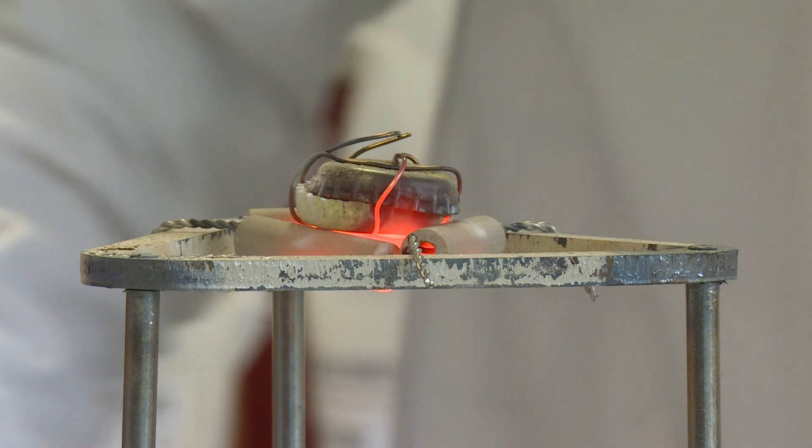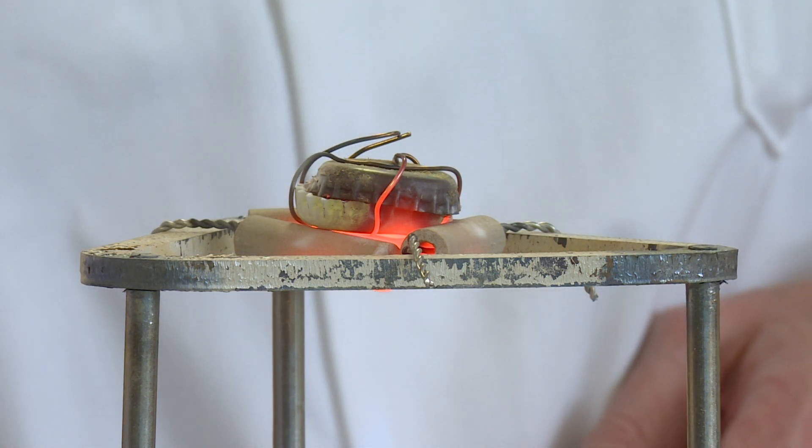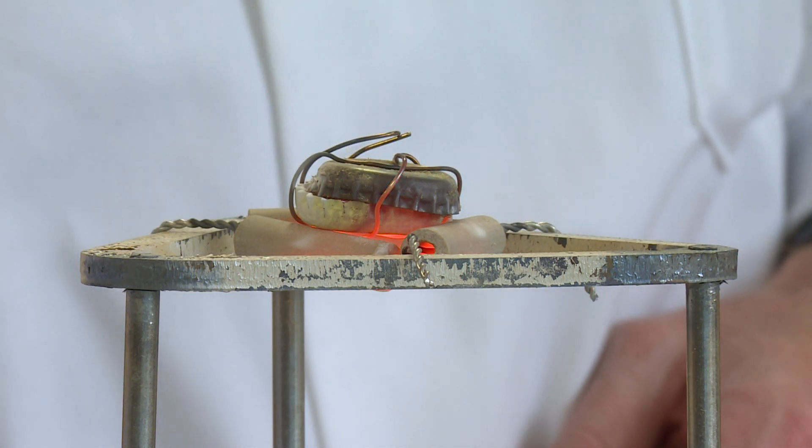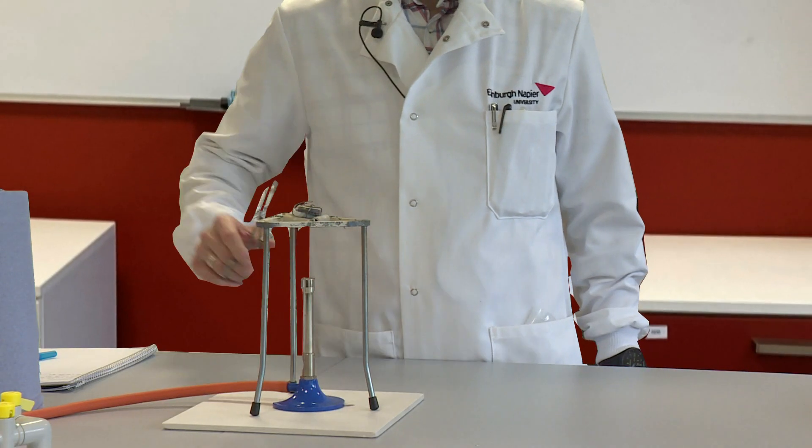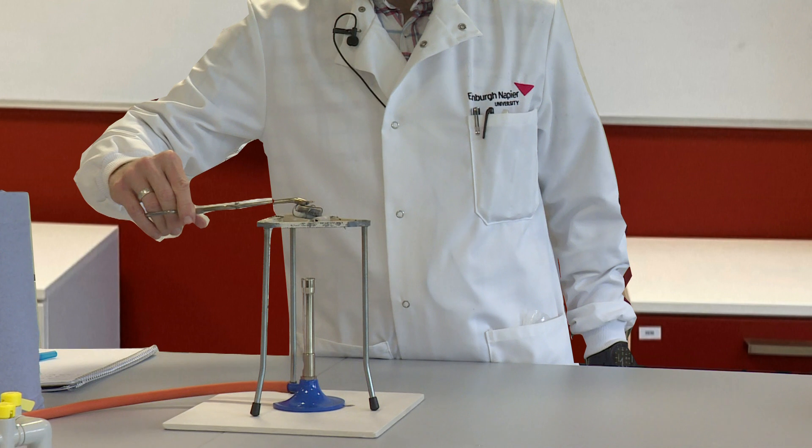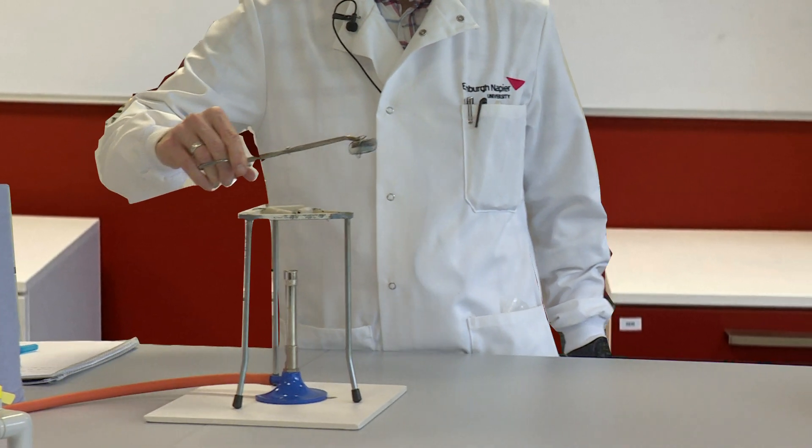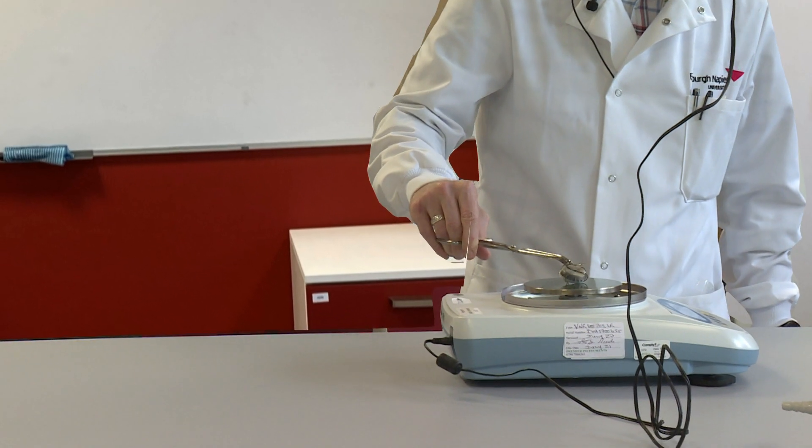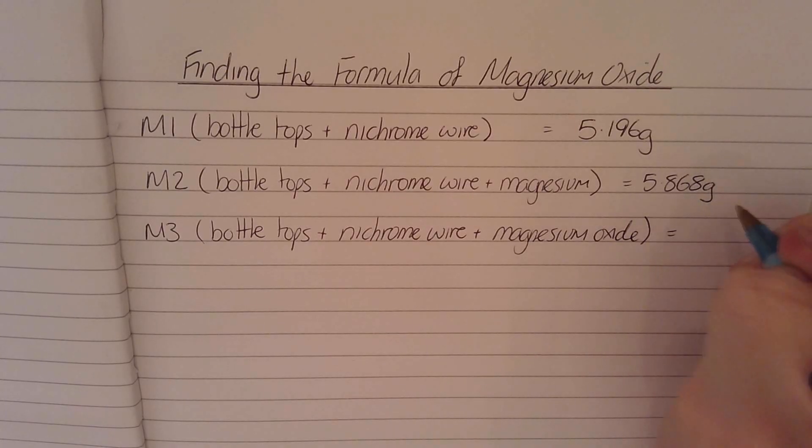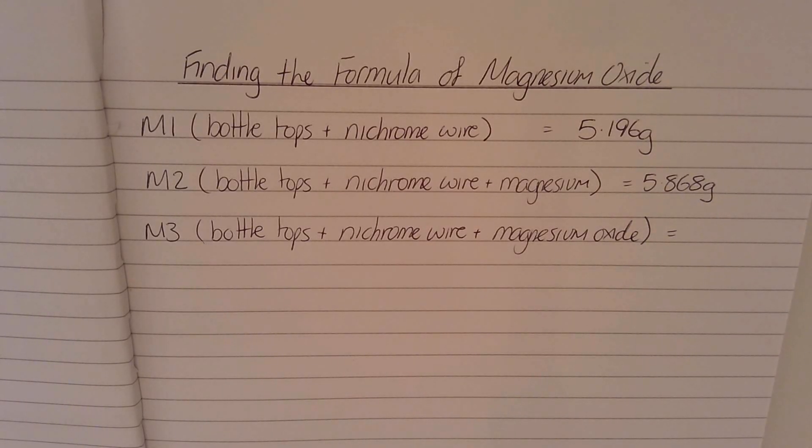So we'll now turn the Bunsen burner off, and we'll allow that to cool for a few minutes. If we now transfer the bottle tops and re-weigh them, the mass is now 6.332 grams.